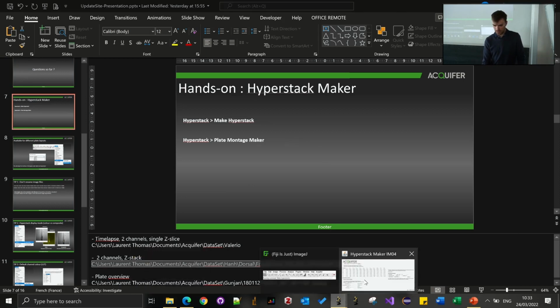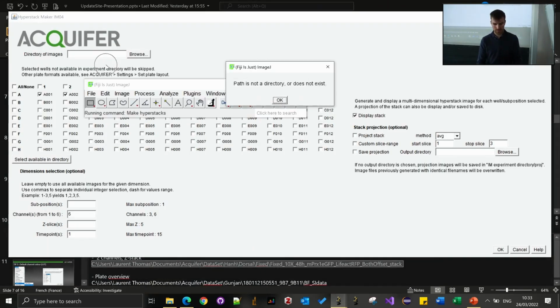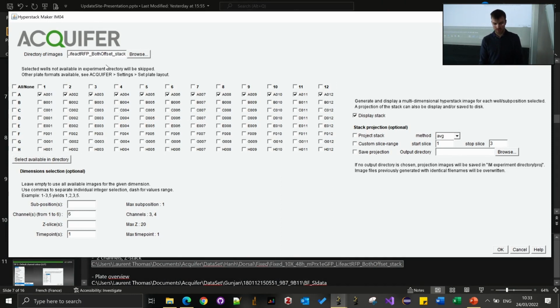Yep. Okay. Again, so complaining, yeah. Okay, so this one, yeah, 20 slices and one time point. And what's there? Okay.